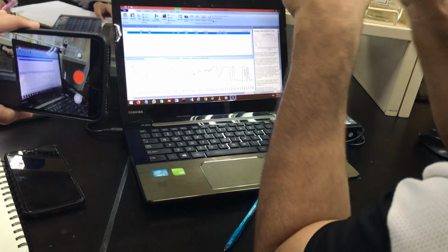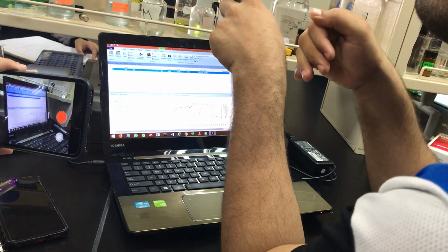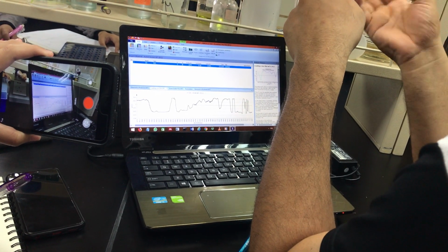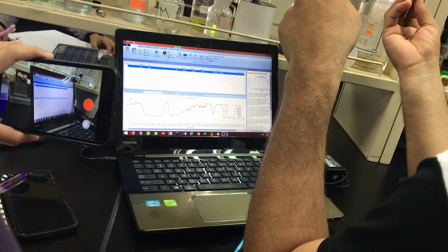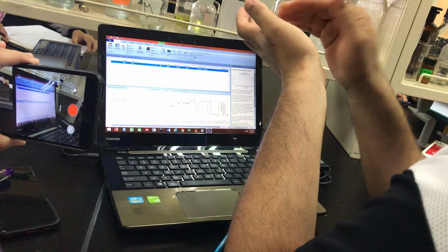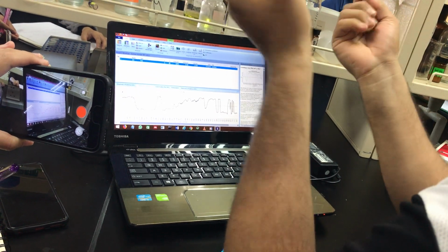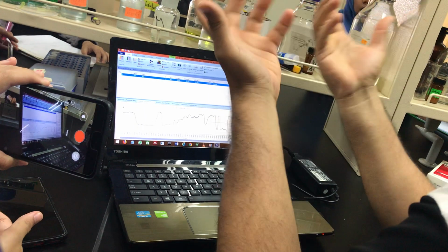However, if there is one extract, let's say water extract, with less activity like 50% or 30%, then the software will start to identify the difference between the spectra. If I give you 5 dishes all sweet and ask you to tell me the difference of taste, you see all sweet, how can I identify the difference? I need one salt. I will tell this one is salt, but if all the dishes are sweet, the software will not predict the difference.